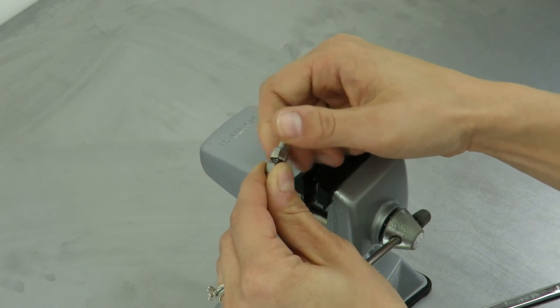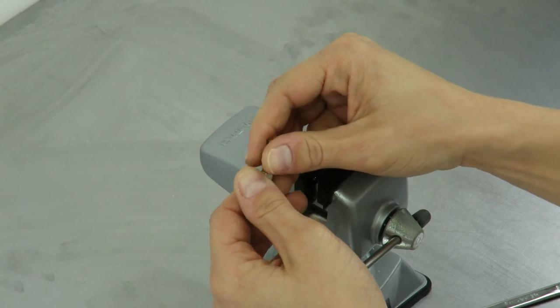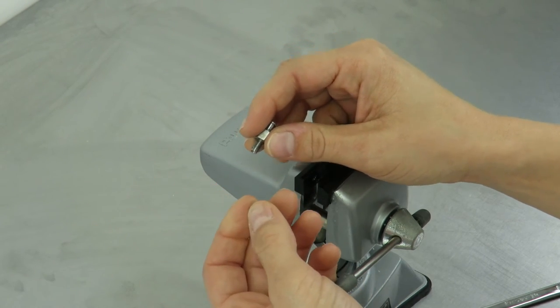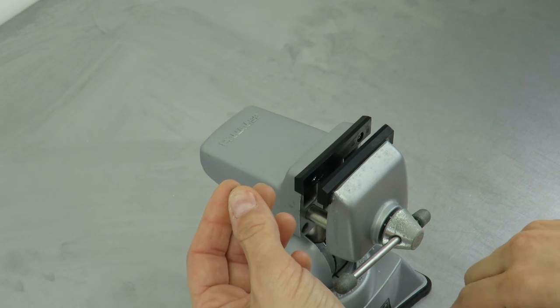First, unscrew the compression nut and remove the metal ferrule that comes in it. We won't be using this ferrule because it's specifically designed for fractional tubing.